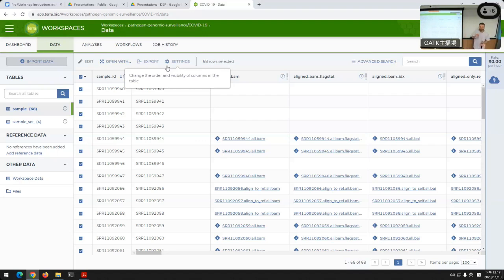And so long as you write that top left cell in that exact format, you'll be able to upload that as a table. And the word that you choose before the underscore ID will be the name of that table. So I could easily create a table called, Anton, right? I would just write entity colon and then put the name of the table that I want, whether it's samples or mice, whatever. And so that's how I can create a table.